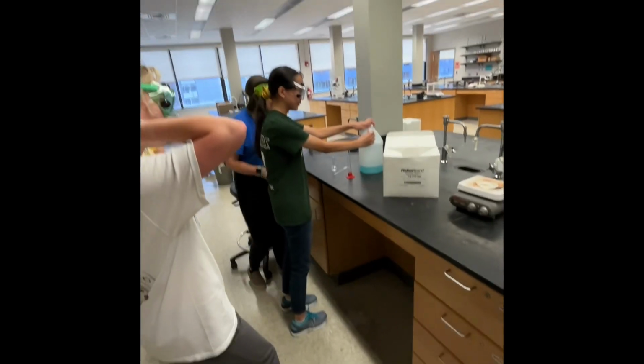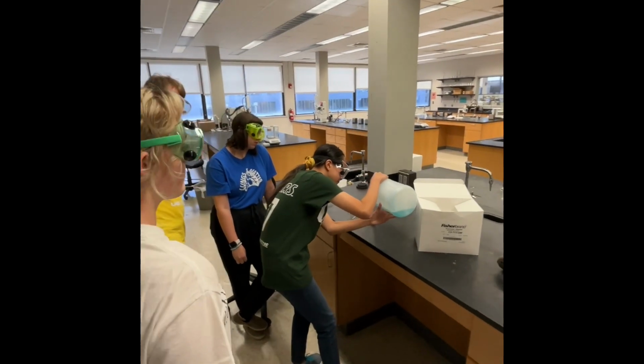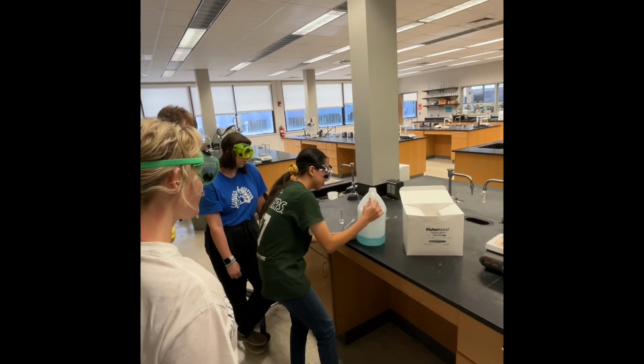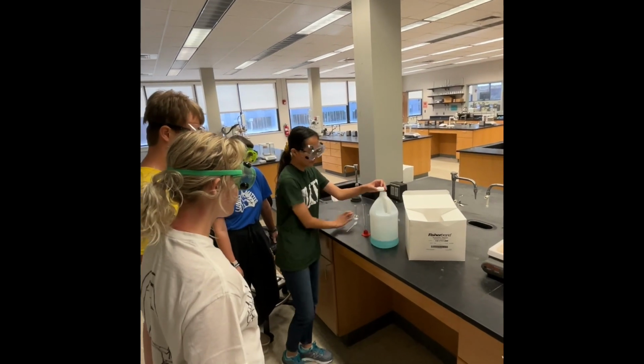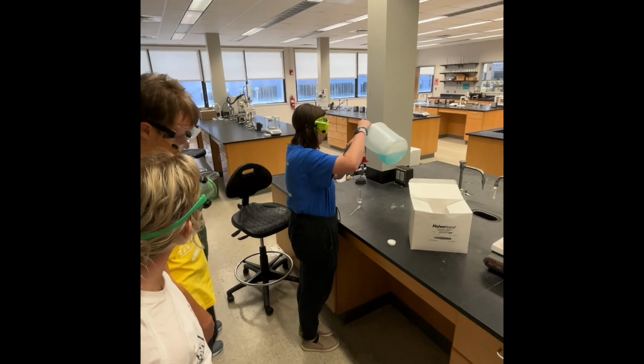First, our lab members washed our hands, and then we proceeded with pouring about 25 milliliters of our stock solution into a graduated cylinder. Now I want to take the time from this extra footage to talk about the prep that we did before starting the experiment.